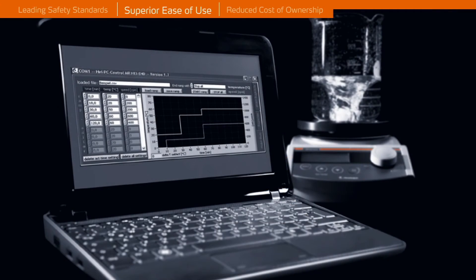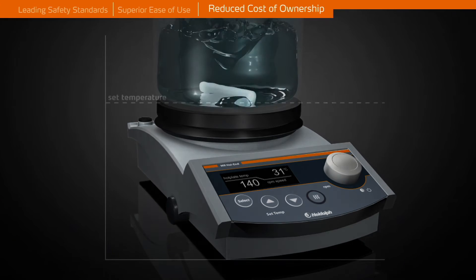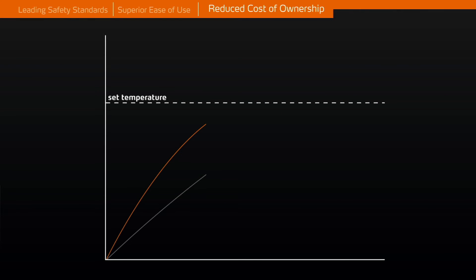An optional software program is available for the MR high-end to aid you in automating your process, and the software saves all data in electronic files. The extended heating capacity of 800 watts reduces heat-up times by 35% compared to 600 watt units.